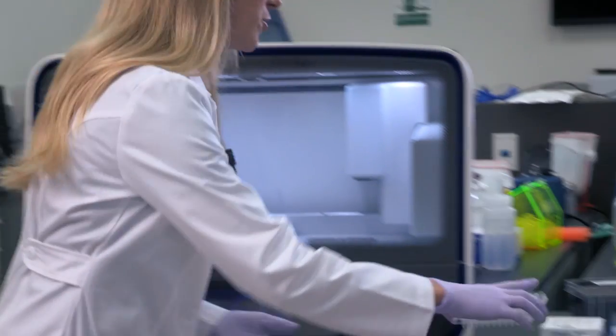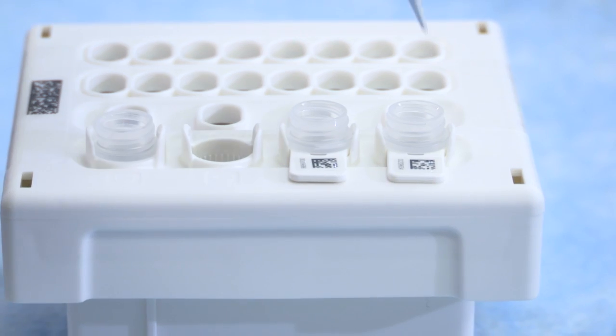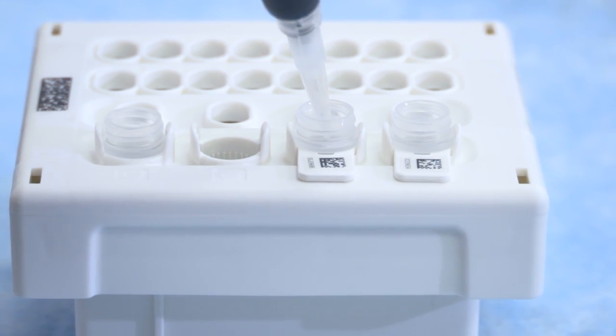Now you need to pipette your primer pools into your reagent cartridge. Ion Chef can now do one or two pool AmpliSeq panels, and you'll see that the tubes are labeled with 2D barcodes for tracking during your run. Now that our three quick pipetting steps are done, all we have to do is put our consumables onto the Ion Chef.